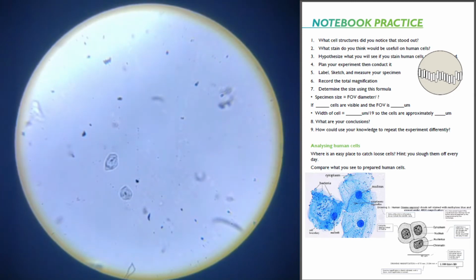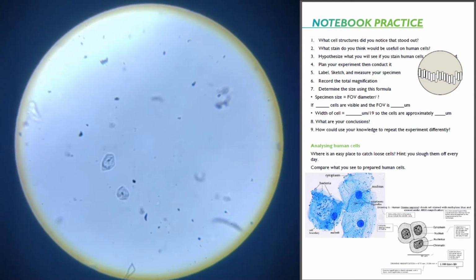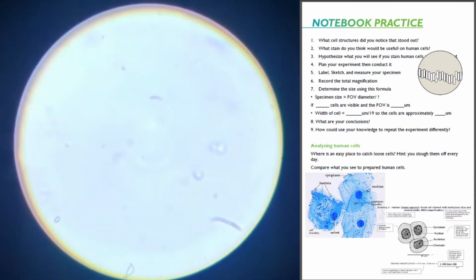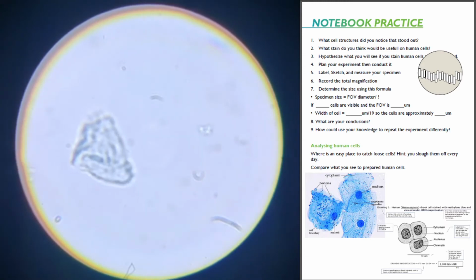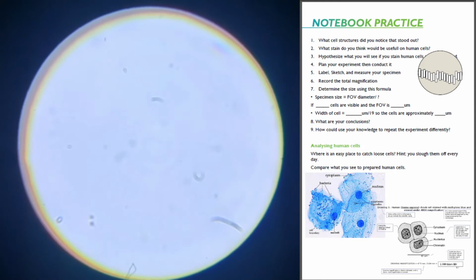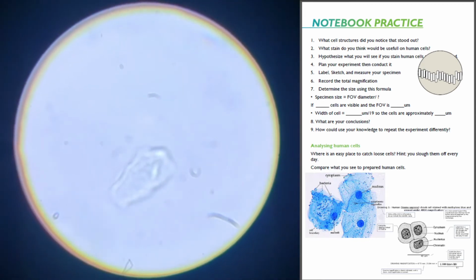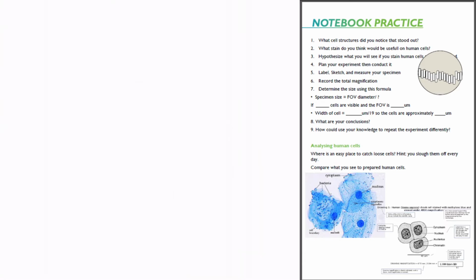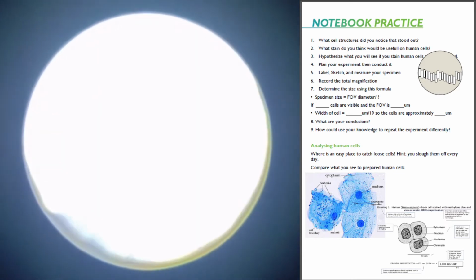Nice cells. And I lost him. There's a cell. Another cell. So my methylene blue needs a little bit more. I'm going to pull this back out. I know where those cells were.